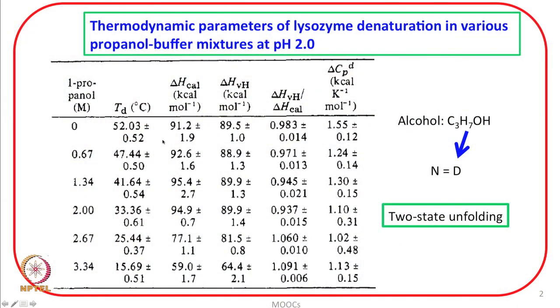So, the way the interaction of co-solute or solvent with the protein may affect the thermal transition temperature or the other associated thermodynamic parameters can initially be predicted based upon the nature of the molecules, or in other words, the data obtained can be interpreted in terms of a possible intermolecular interaction, and we can appreciate, like the data presented in this table, that differential scanning calorimetry will quantitatively enable us to understand these interactions.